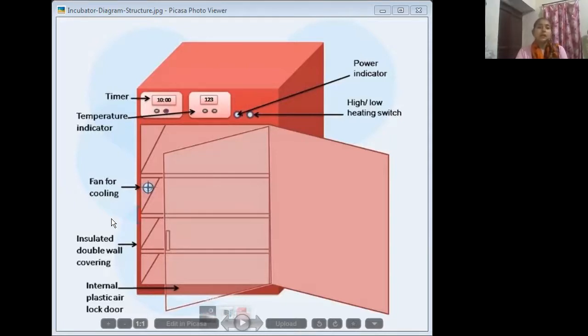Next, asbestos gaskets. The asbestos door gaskets provide an almost airtight seal between the door and the cabinet. This seal prevents the outside air from entering the cabinet and thus creates an isolated hot environment inside the cabinet without being interrupted by the external environment.